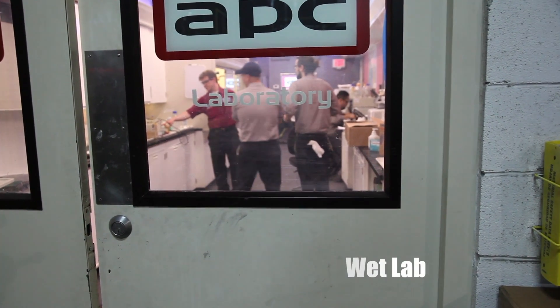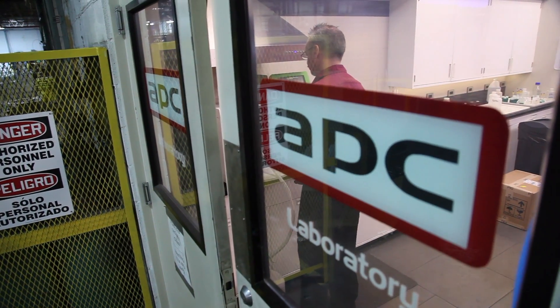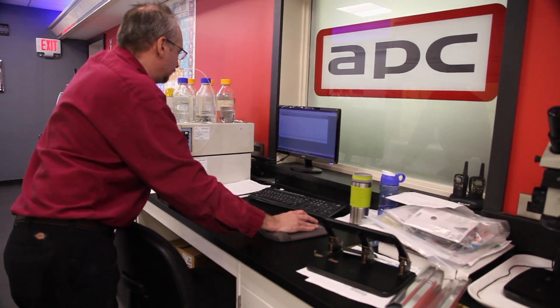Let's go talk to John in the lab. Hi, my name is John Kramarczyk. I'm the laboratory manager at Arlington Plating. This area is responsible for maintaining and monitoring all the plating solutions that are out on the production floor. Let's go around and look at some of the equipment.